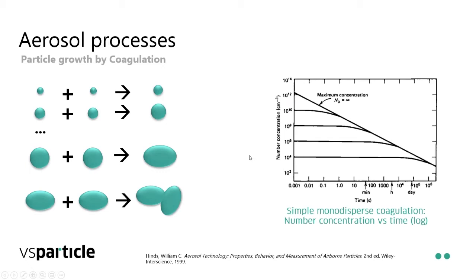Now, in our case, when we try to work with making materials or trying to do experiments, we of course want to have a lot of particles. And so that means we have to work at very short timescales. Typically around a second, or preferably well below a second if you want to have large numbers of particles. That's something just to keep in mind with what we're doing. And at this point, I want to switch more to about how you could make particles for aerosol studies.